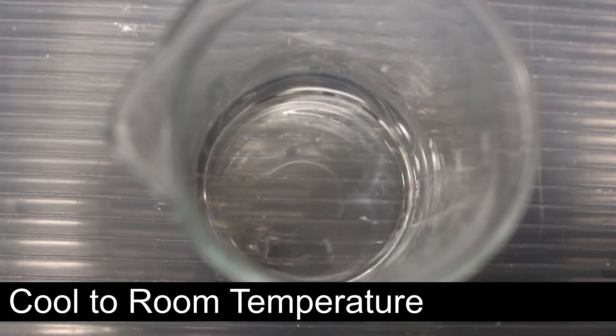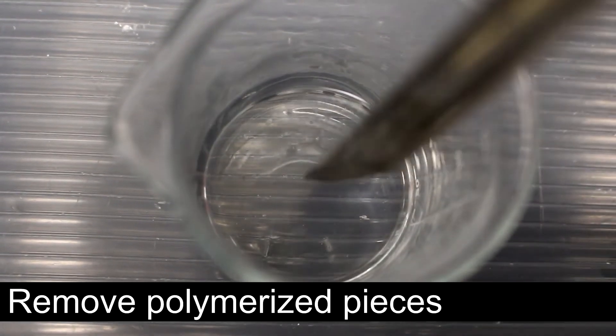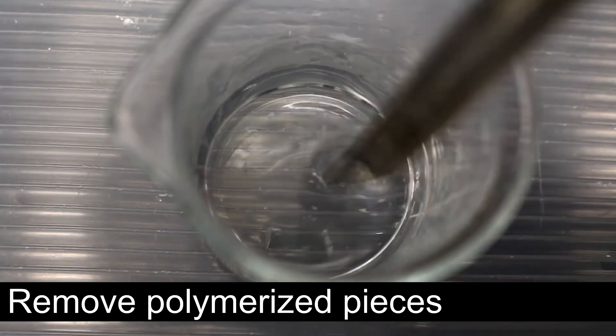The solution is left to cool to room temperature, then the solution is checked for polymerized pieces on the surface which are removed with a metal stirring rod.